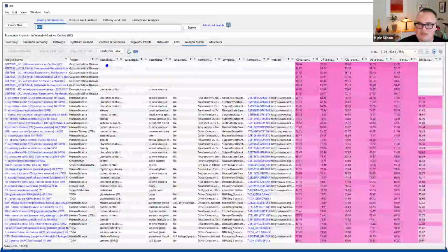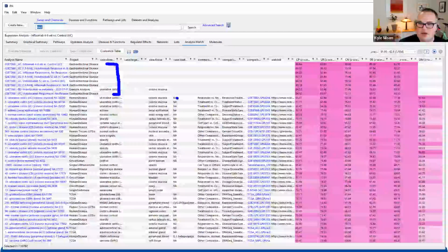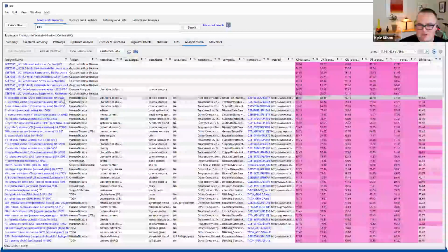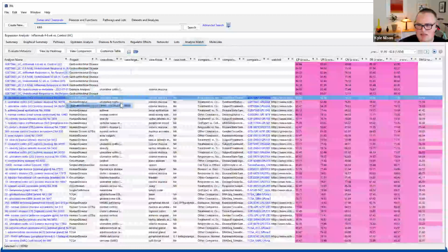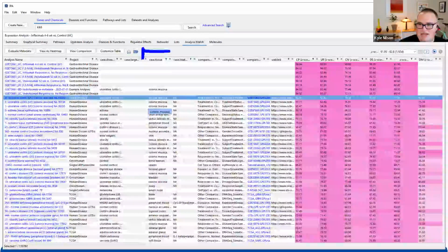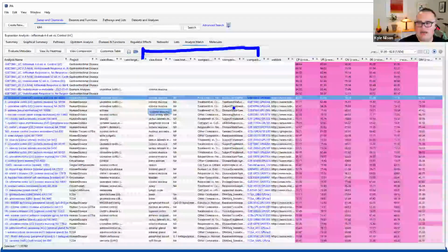In addition to these results of your own, you also get public results. And so what do I mean by these public results? Let's say, for example, I am curious about this particular item. I have a number of metadata fields available which will let me see exactly what I'm looking at.